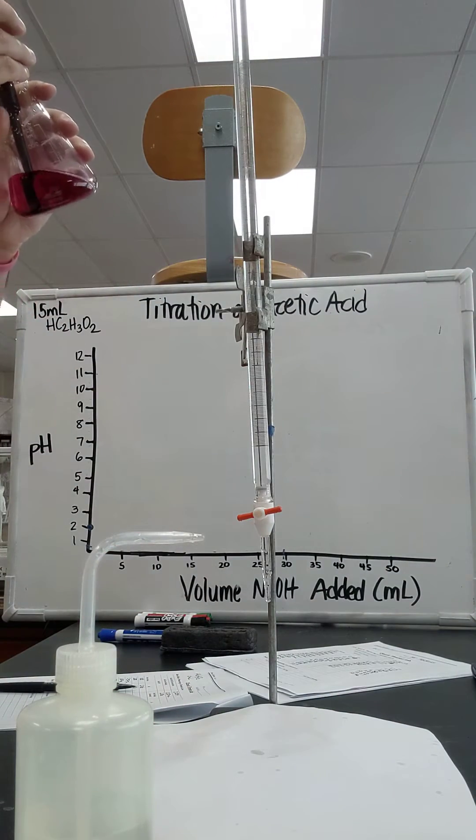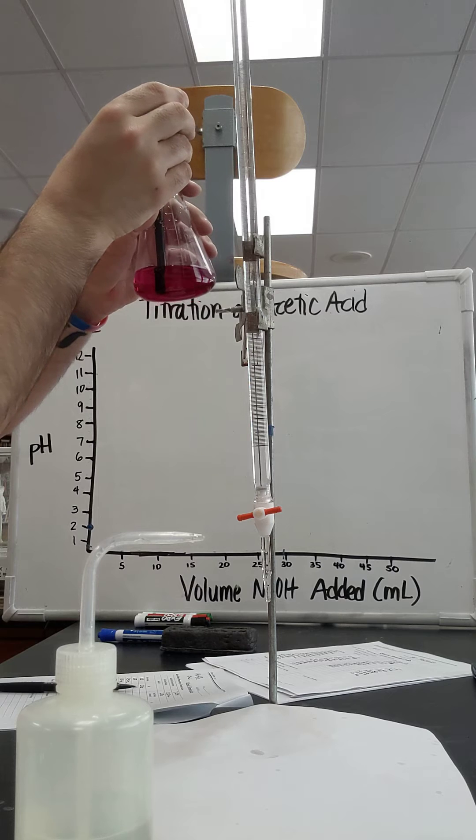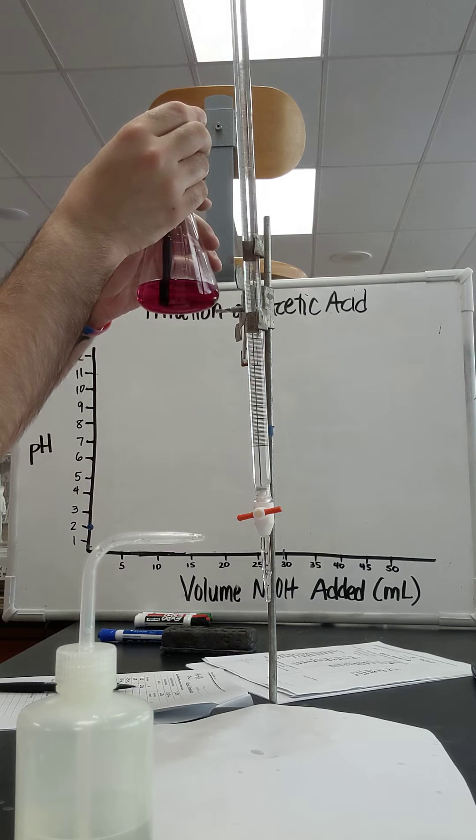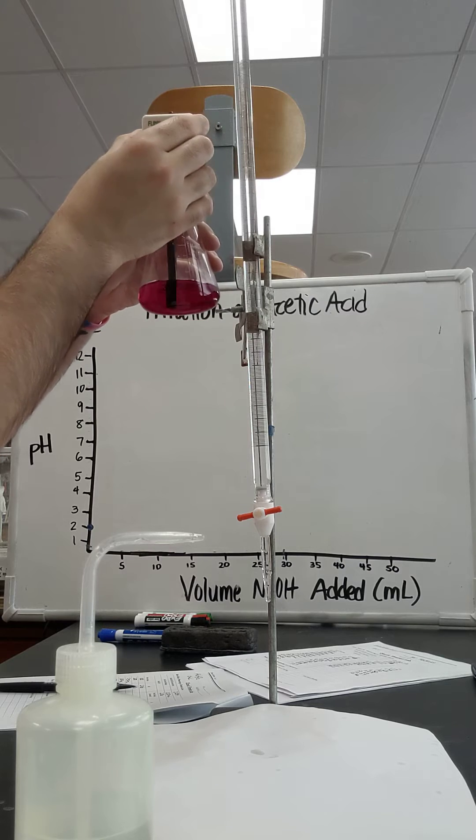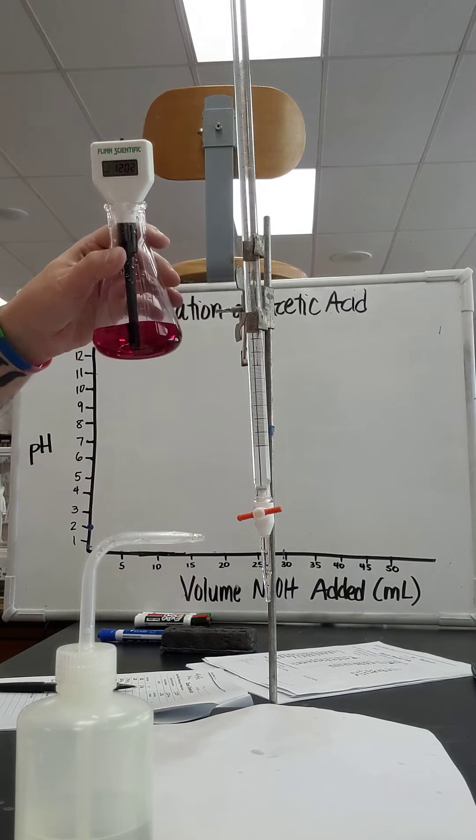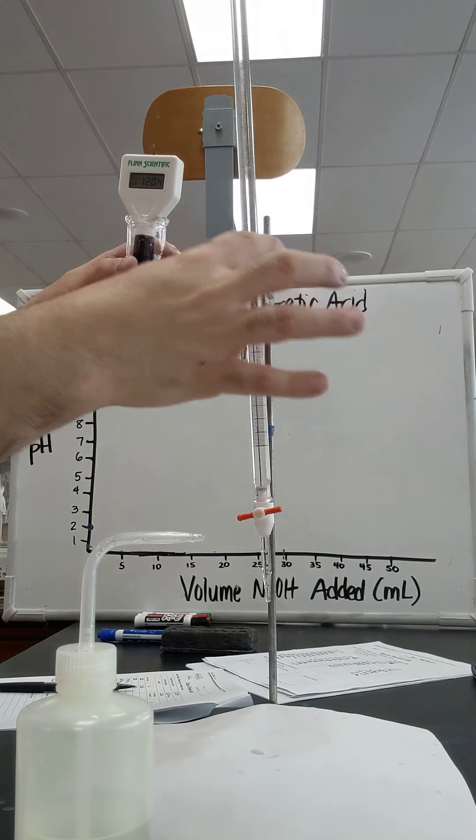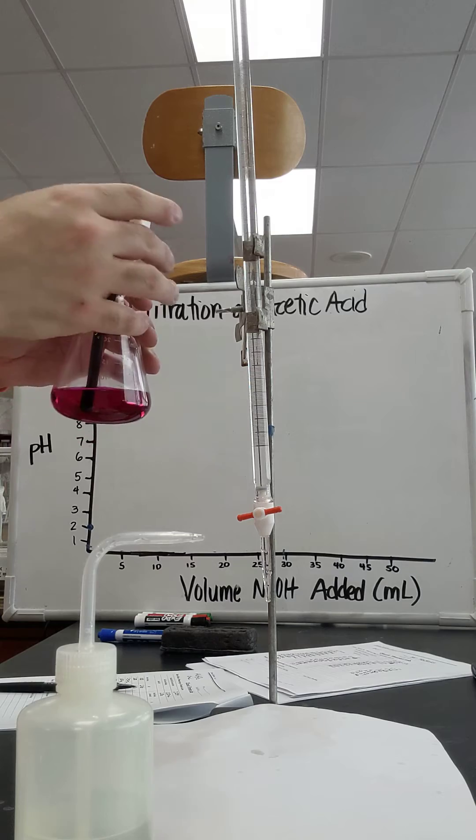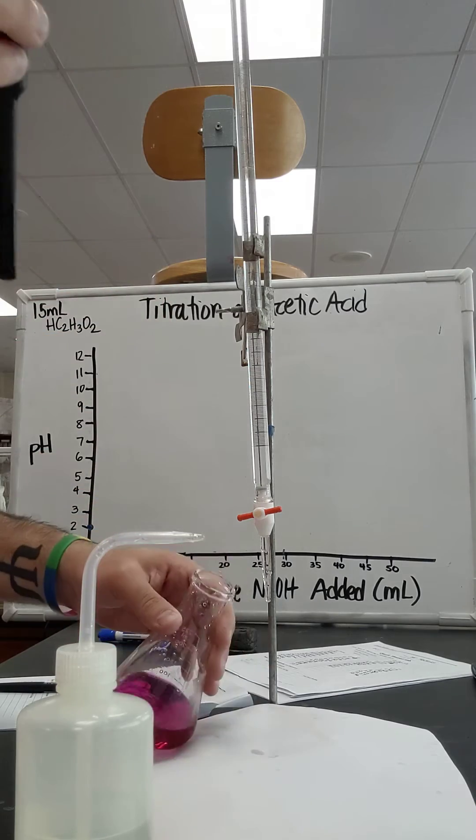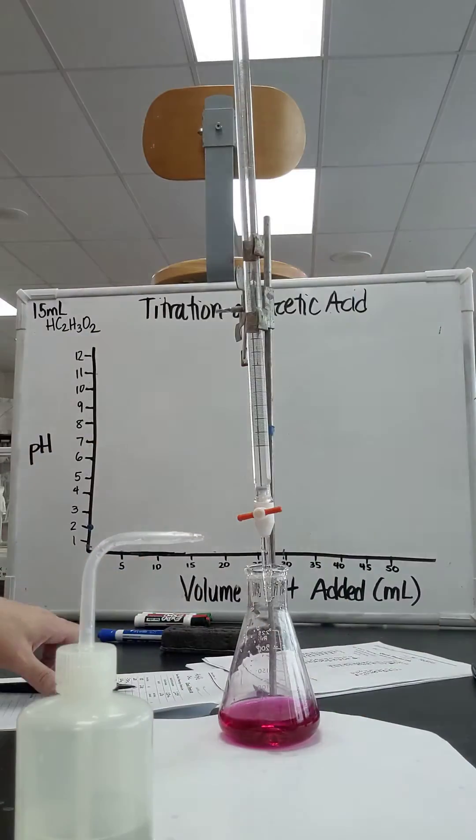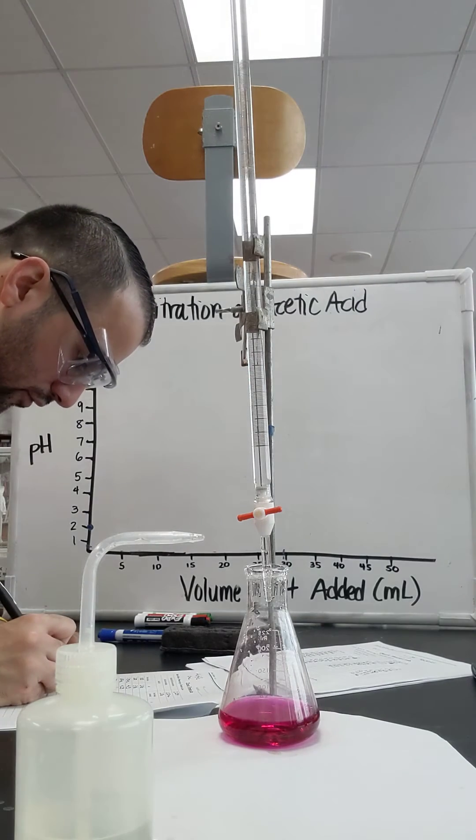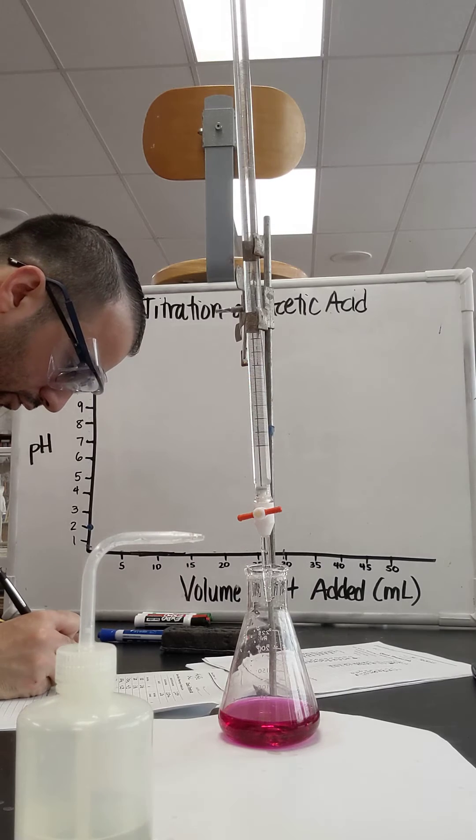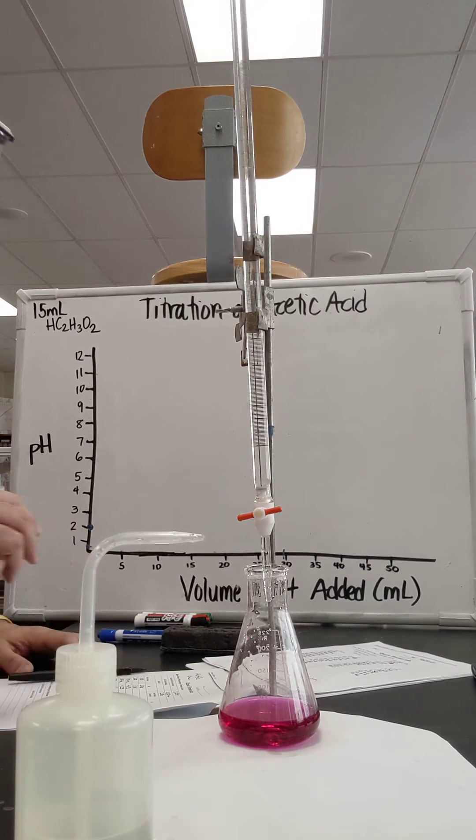pH is about... Oh, we jumped way high. Now we're at 11. And the readings are very finicky, it doesn't read it automatically. It keeps on moving. That's why there's like a lag and a dead air time sometimes because I'm waiting for the measurement. So I got 12.08 is my pH. So it jumped way up there. 12.08 after having dropped 9.5 milliliters.